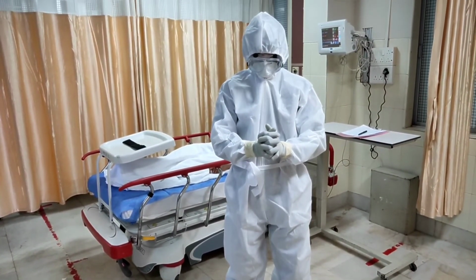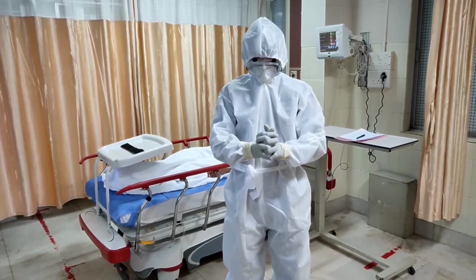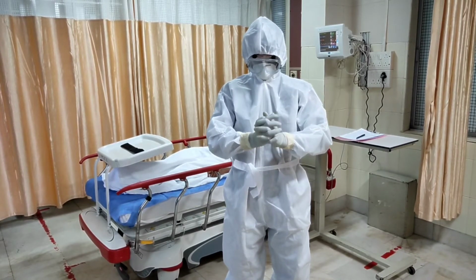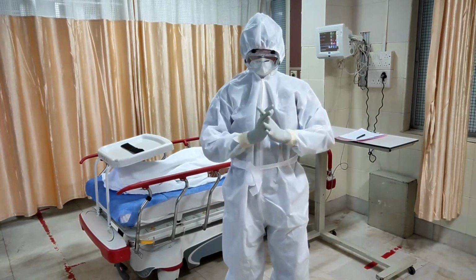If there are any damage, tears or spillages in your PPE, kindly rub the area with appropriate sanitizing wipes or use hand rub solution over a gauze piece. Once you have sanitized your PPE, get the attention of your spotter and ask for permission for coming out of the decontamination unit.